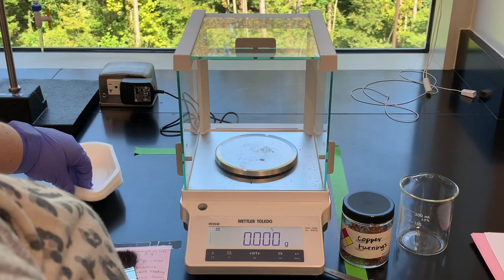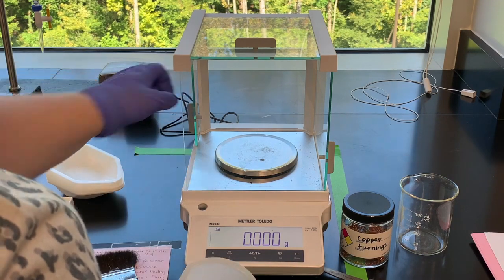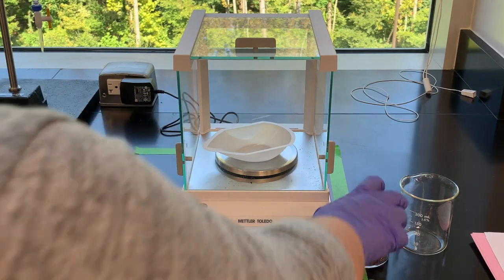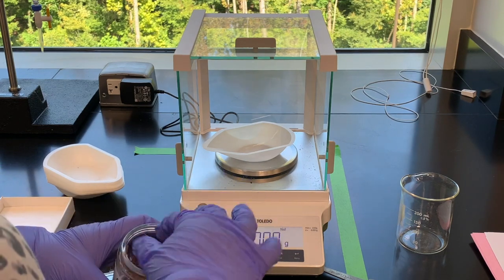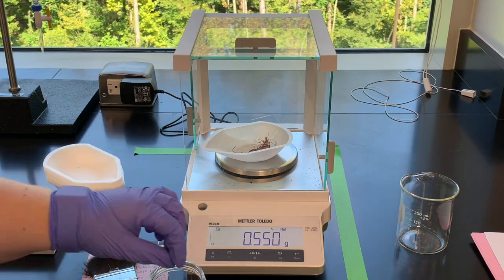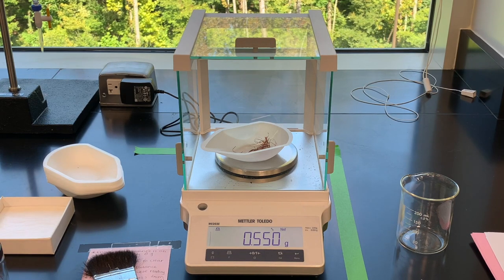Okay, so now that I have my balance on and zeroed out, I'm going to put a weigh dish on there and then zero out that mass. So here we're looking to get about 0.5 grams of our copper. Okay, so we have 0.550 grams of copper. Make sure that you record that in your report sheet.